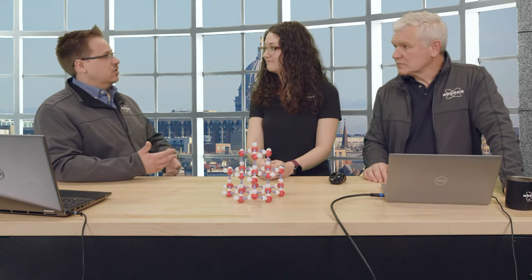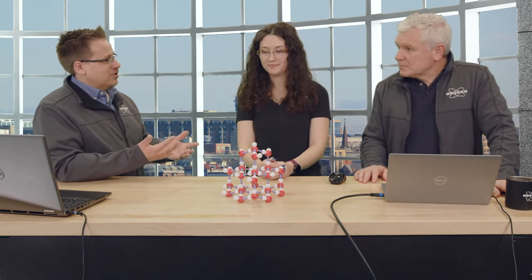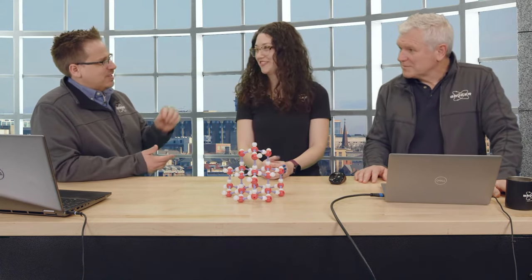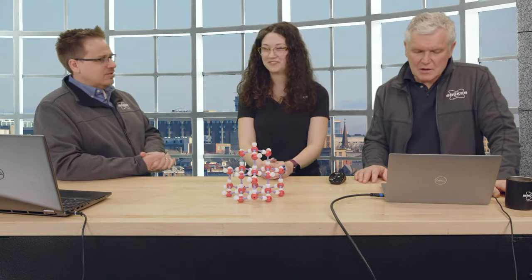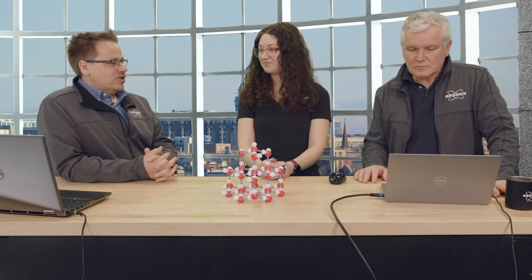Now, in terms of data collection time, how long would a typical data set take? How long was this one? It's copper. I collected pretty good redundancy, with short exposure times. A couple of hours. Okay, a couple of hours. Oh, that's pretty good. I was imagining you'd say maybe a few days, especially when capturing these tiny little satellites. Wow. Things have come a long way in the lab. All right, so I think we're going to see now some software from Michael.